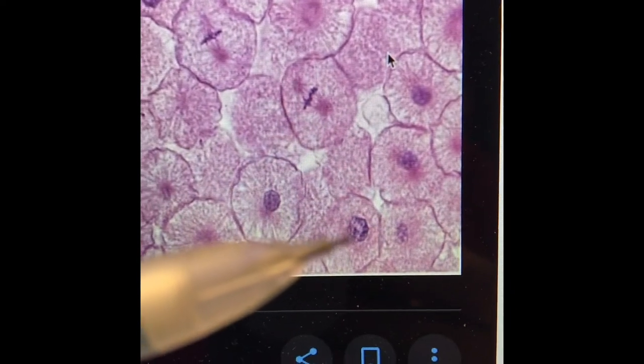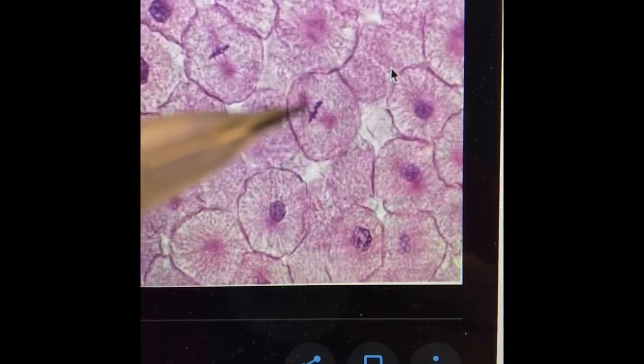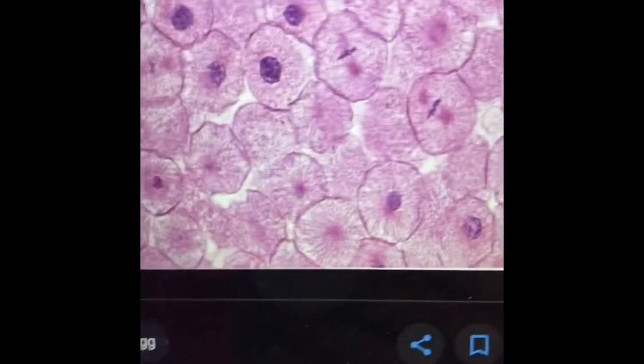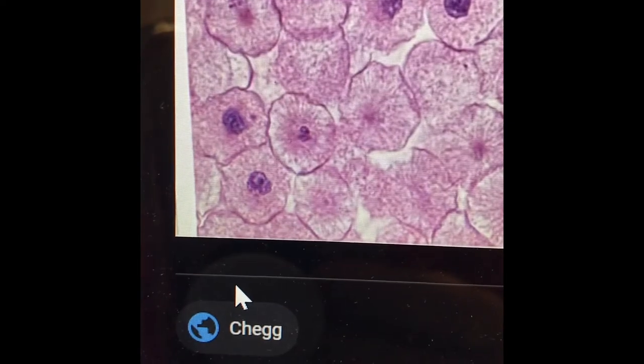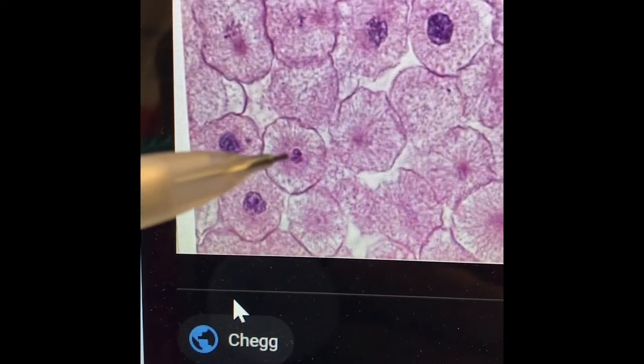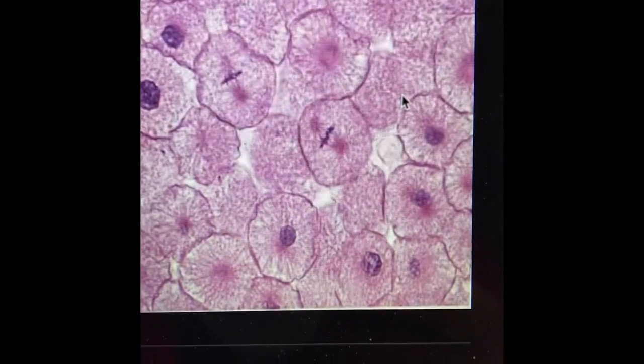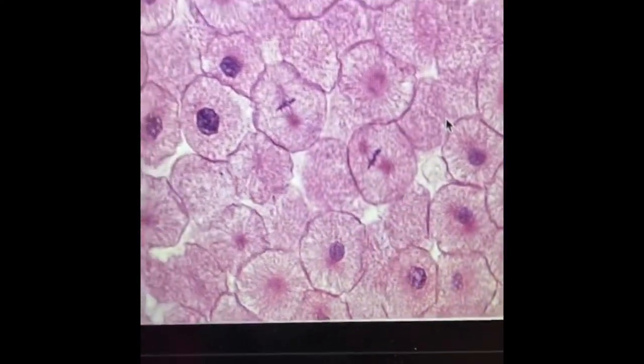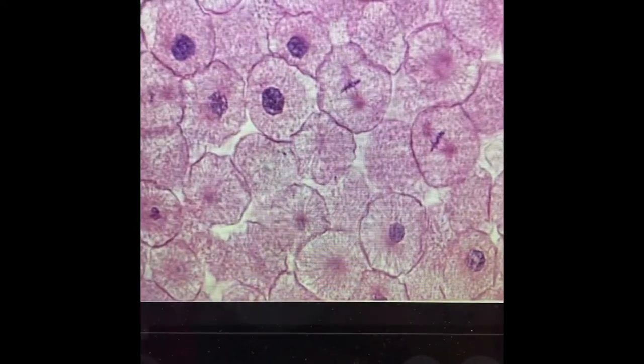This one's a metaphase. Not prometaphase. We have to find prometaphase. And then if you look around, you may see different ones. That's a cool one right there. That's a cool one. Look at that. Okay, let me see if I can give you another picture that you could utilize as well. Any of these that you see in here that you want to use for your drawings, go ahead and do that.